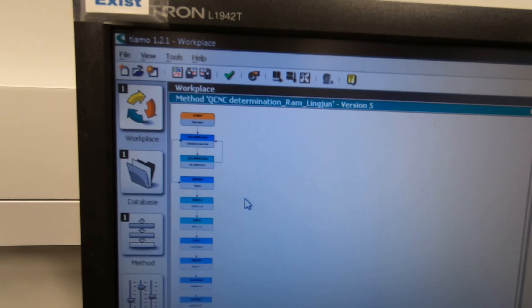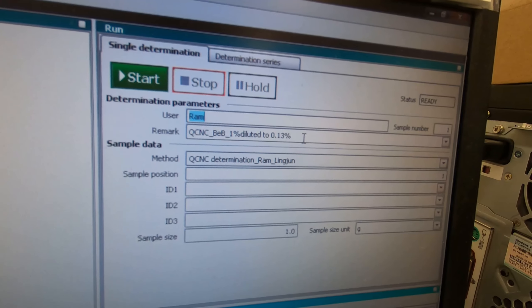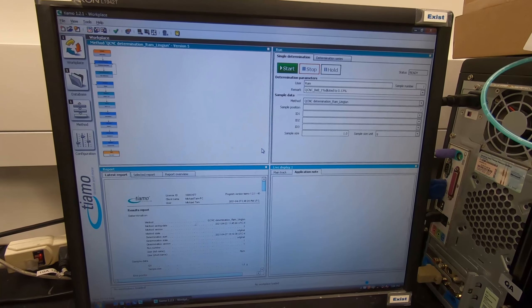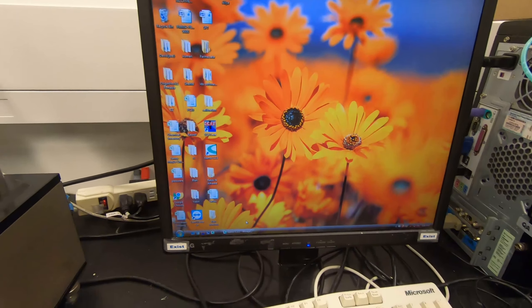The workplace is going to be here. Change the name, username, and the example you're going to use. Make sure you have chosen this method. I've opened the report to show how the report looks.